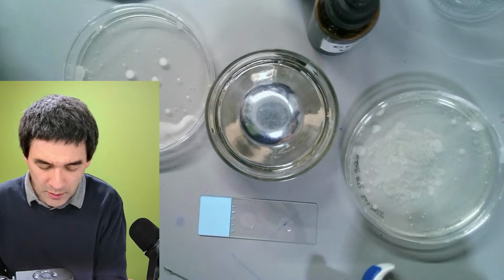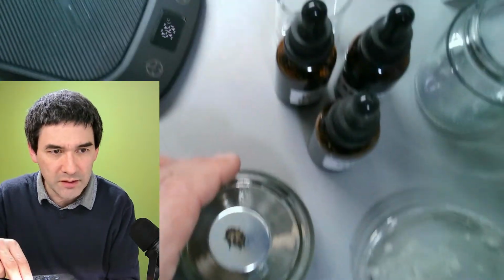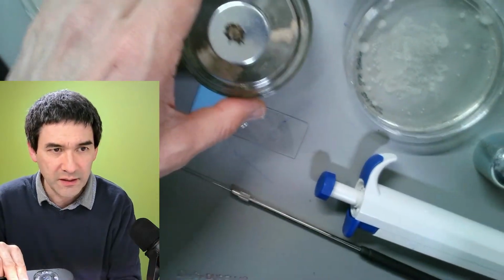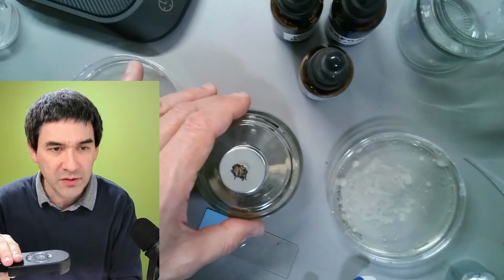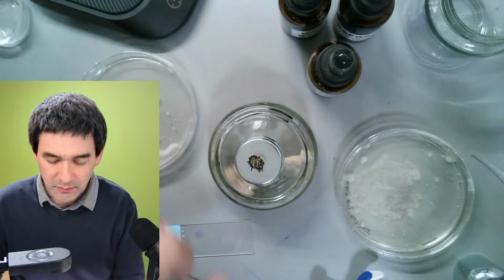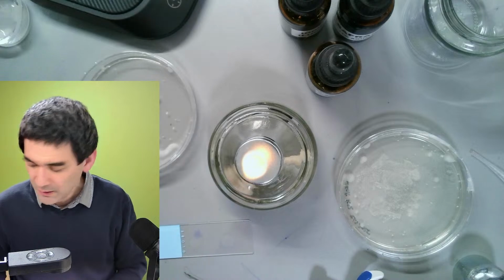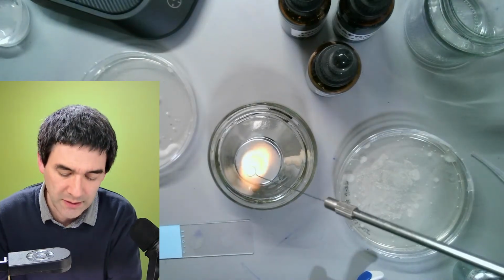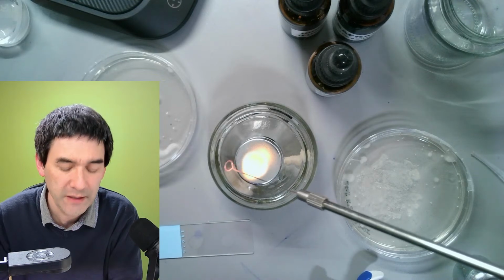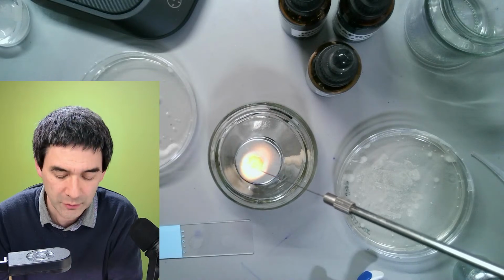I will now turn on the lamp, making sure to move it away a little bit because of the heat of the lamp. Yeah, that's fine. Here we go. The first thing you want to do is hold the loop into the flame until it glows. This basically kills off any bacteria that are possibly on the loop here.